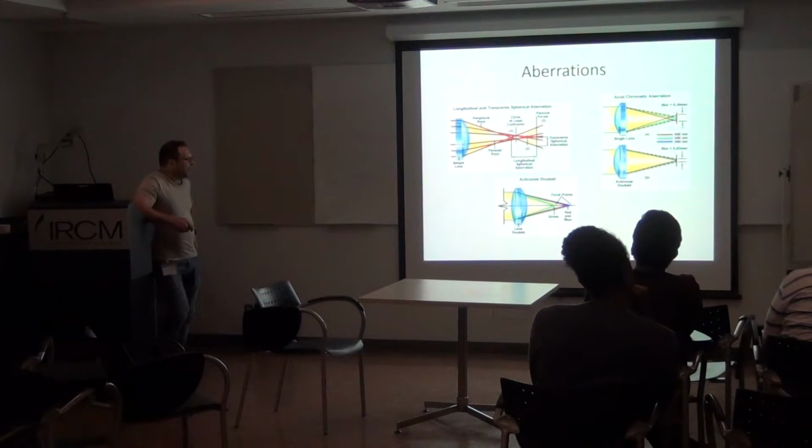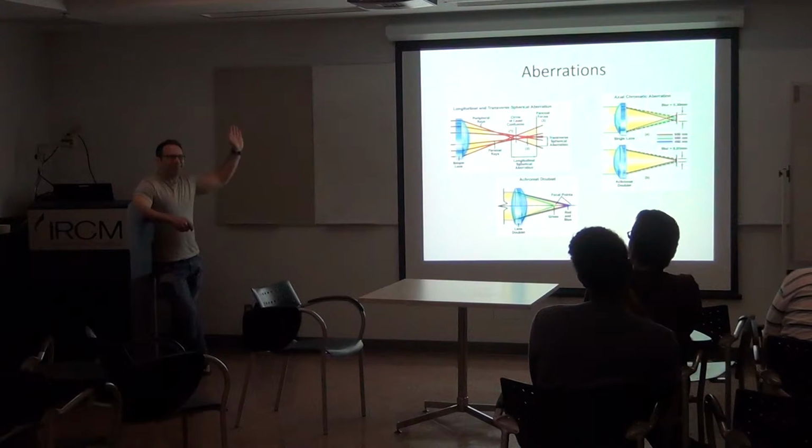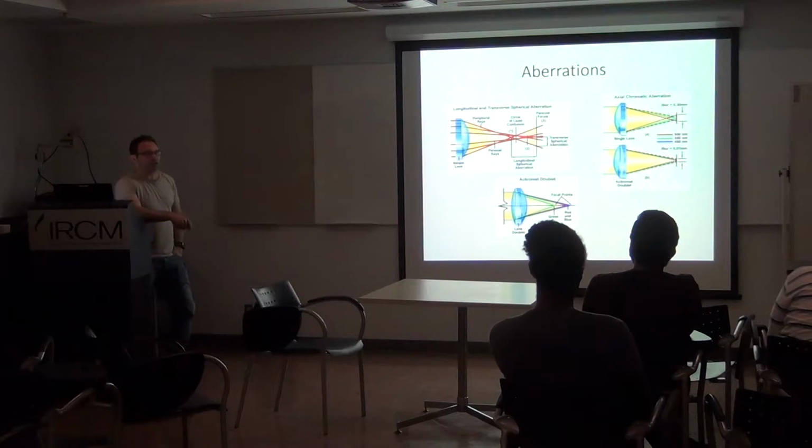And the other aberration comes from the fact that the blue, the red, and the green, the major components that your eye sees, will not focus at the same position. You remember the arc-en-ciel, the rainbow. So the refraction is not the same regarding the wavelength. And so there are ways to use some kind of glass and put it at this position and this position and so on to correct those chromatic aberrations.